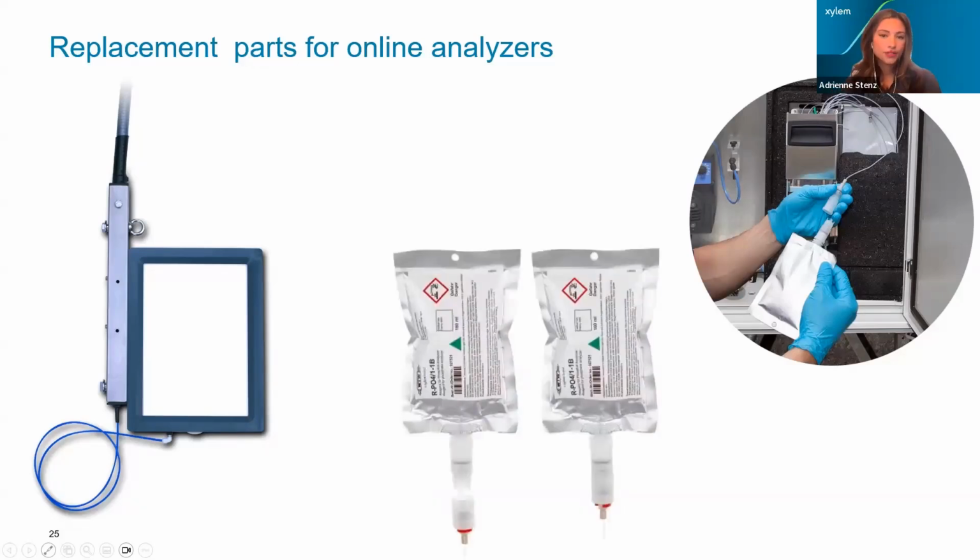The main consumables for an orthophosphate analyzer are the reagents. The reagents have to be replaced every 3 months when operating at the minimum 5-minute measuring interval. The measuring interval is user selectable from 5 to 60 minutes. So the longer you set it, the longer your lifetime of reagents will last.